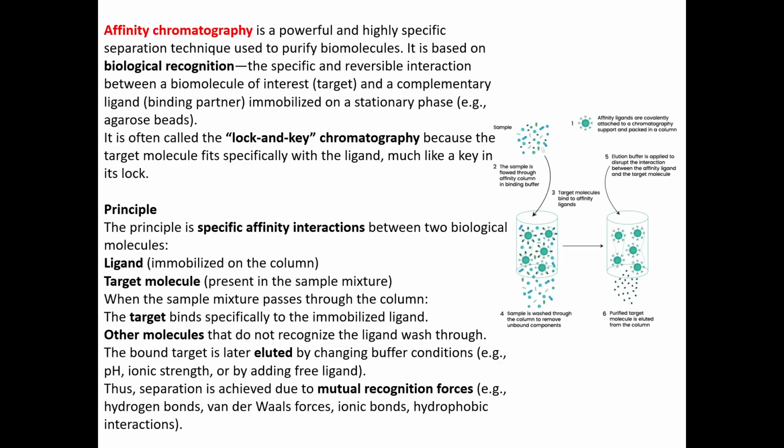So this week, the syllabus was affinity chromatography. So let's just go in brief, just have a recap of what affinity chromatography is. So affinity chromatography is a powerful and highly specific separation technique.